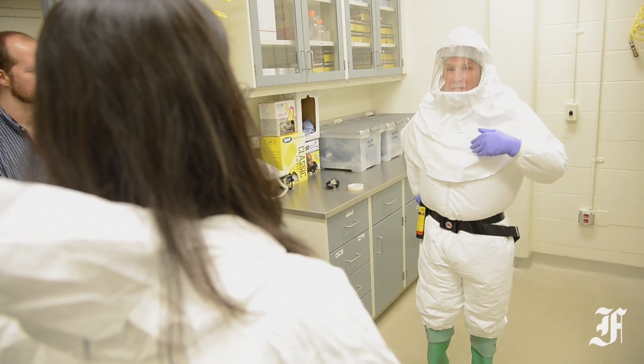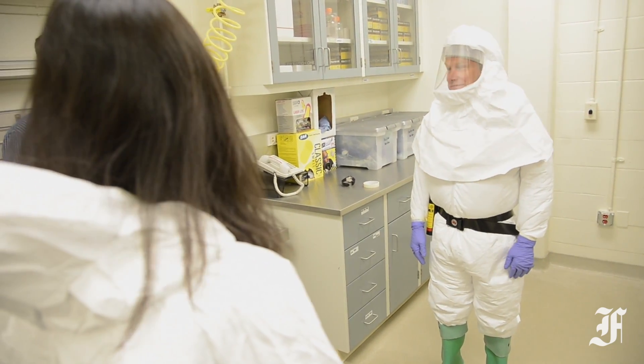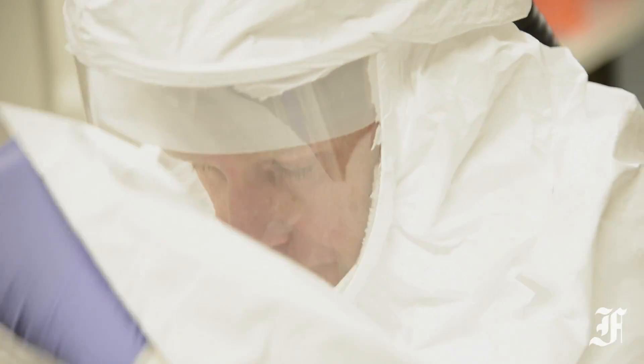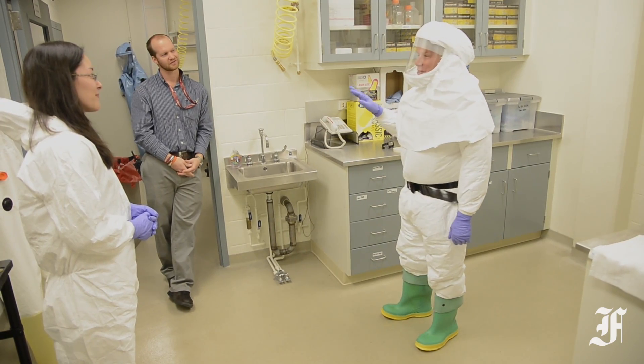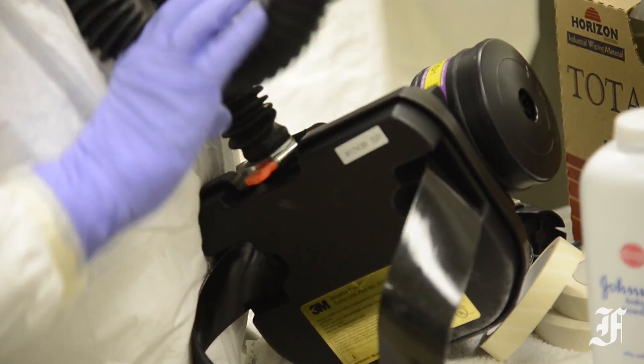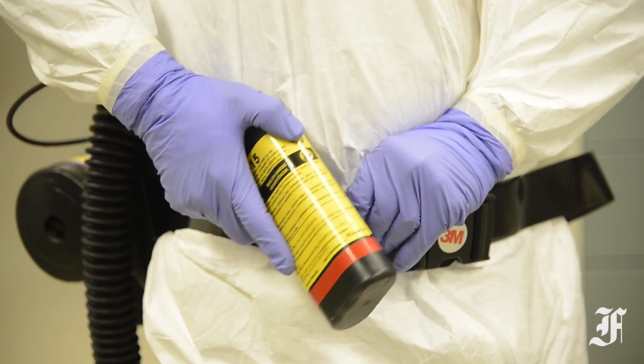While not as well sealed as the suits used in research labs, the PPEs used in hospitals and clinics do share one major similarity with those found in the USAMRID labs. They use positive air pressure in the mask and suits to help ensure that pathogens don't find their way inside. The air pressure is provided by a battery-powered air filter worn on a belt that pumps clean air into the mask and Tyvek suit.